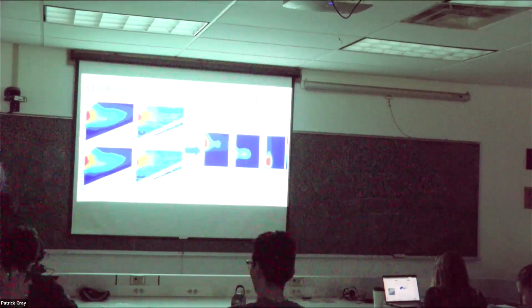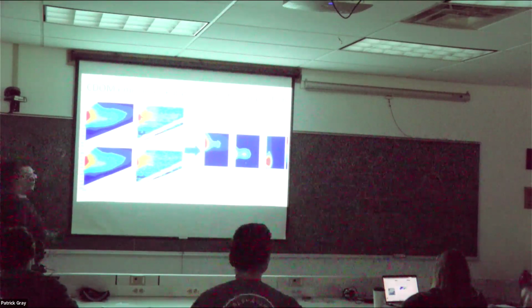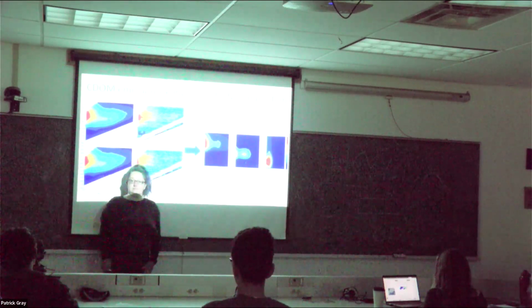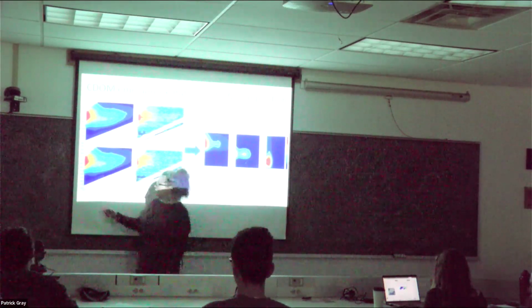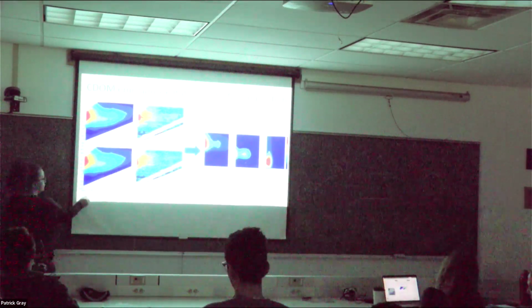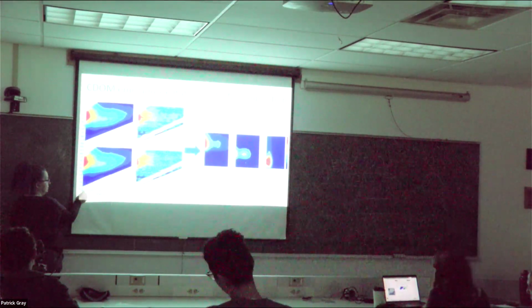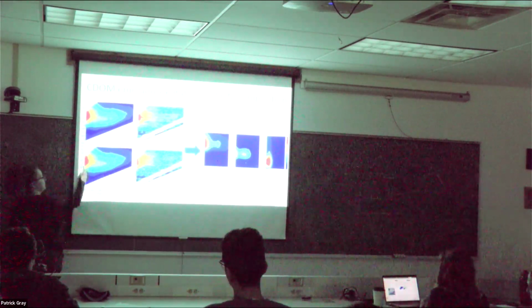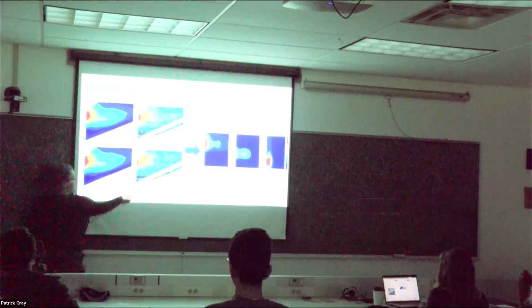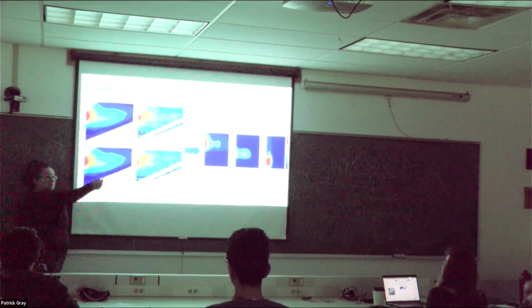And just the second question, in those regions that are cut off, why are they cut off? Okay, so where does the fluorescent go? Where does what? Oh, shifting up. Yeah, so it's cut off because if I'm shooting a light, this is my excitation. If I'm shooting a light at 250 nanometers, you can see emission on all these wavelengths. But if I'm shooting a light at 400, there shouldn't be any fluorescence at 275.